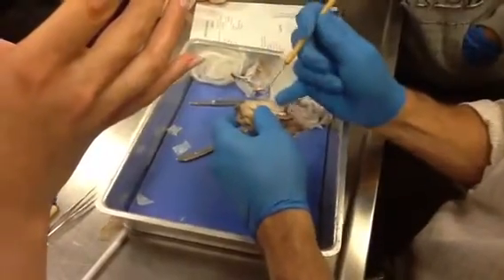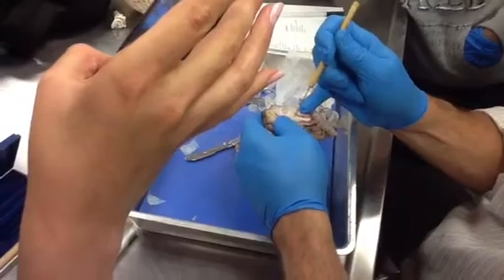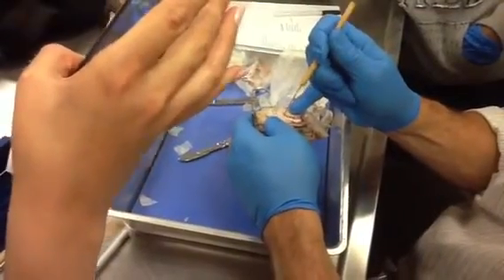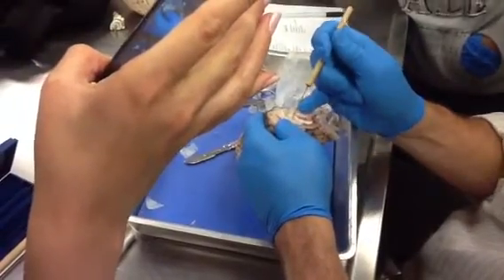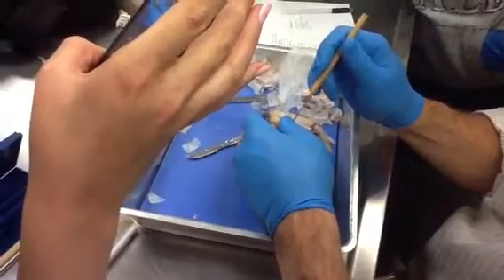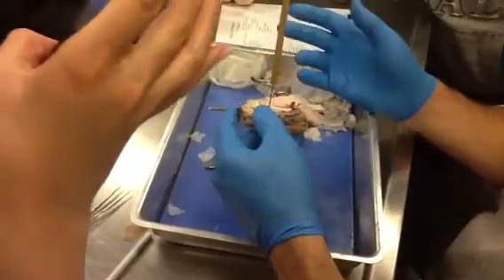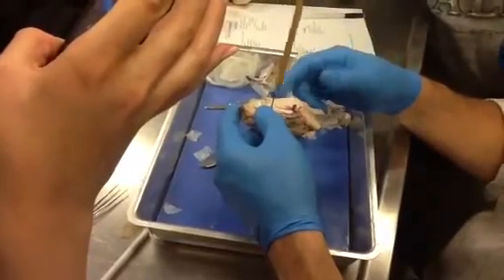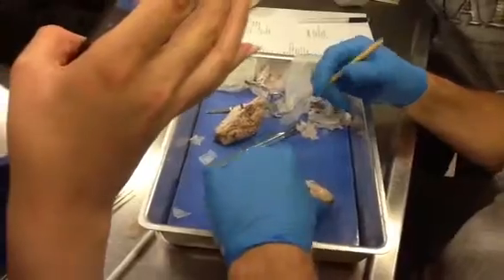where I actually have to go through this membrane, kind of have to pierce it a little bit to get into the lateral ventricle. You see how I did that? Well, not all of you did, but I'm piercing through that little flap, the septum pellucidum, to get into the lateral ventricle. So I could say, like, where's my probe? What space is it in? Lateral ventricle. What membrane does it pass through to get there? The septum pellucidum, the window.